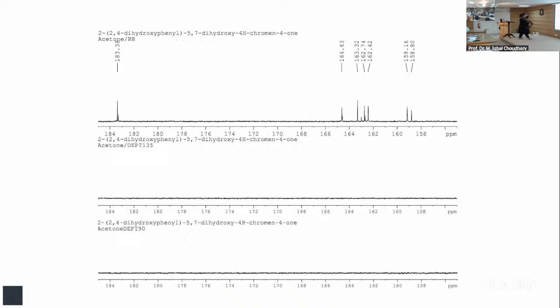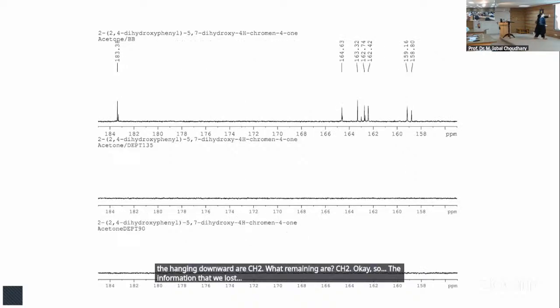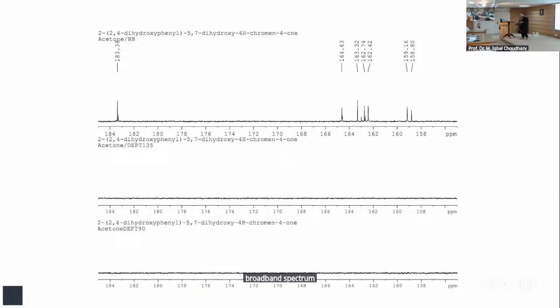The information that we lost in the decoupled broadband spectrum, as Dr. Iqbal showed you in the coupled spectrum of carbon-13, when we decouple it, and you remember one of you told me, sir, that you can decouple when you have a very high proton frequency. They are just moving like a fan, so they decouple. So we lost the coupling information here.